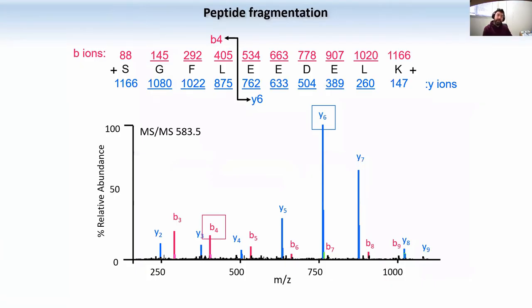And let me go forward here, and let me show you this. Now, this is extremely important. If you didn't discuss it already in class, this is the time to clear out how we know that a specific spectrum is a specific protein or a specific peptide. That's because when a peptide enters into the mass spectrometer and you filter it and you fragment it, this peptide breaks into pieces, right? And it generates a spectrum that we call an MS-MS spectrum, because it's a tandem spectrum. It's not the intact mass, it's the fragments of an intact mass. And then the fragments that this peptide generates have a very specific pattern that corresponds to the sequence of your peptide, right? So that's how we know that this specific spectrum is this specific peptide.